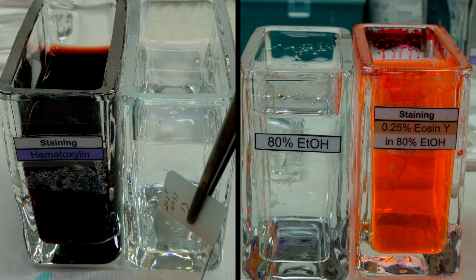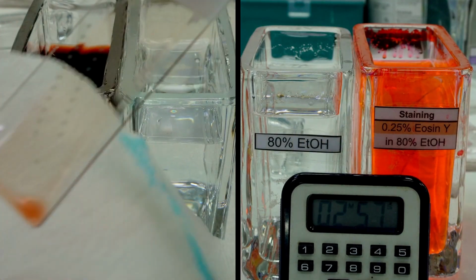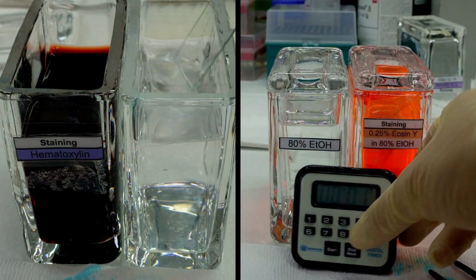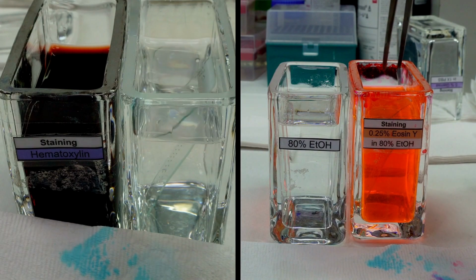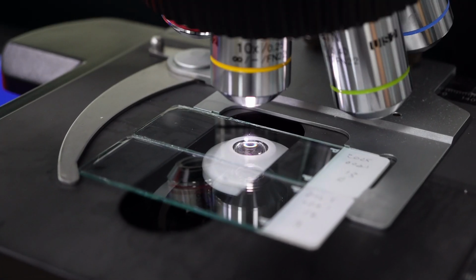It really does. It provides fantastic general morphological detail. You can easily see the overall tissue structure, cell shapes, how things are arranged. It's the standard for a reason before you move to more specialized stains, if needed. So we've done it. From fertilized egg all the way to stained sections on a slide, ready for viewing. Now the payoff. Looking under the microscope. You typically use a standard upright microscope for this.